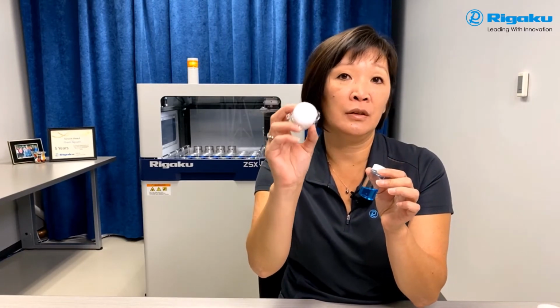Glenn, have you ever thought about which films to use for which type of material, whether it be like a loose powder or a liquid in a cell? Sure, all the time. Depending on what material I have, I'm sure most of our viewers have that same problem. What's compatible for what film? What's going to give me the most signal?